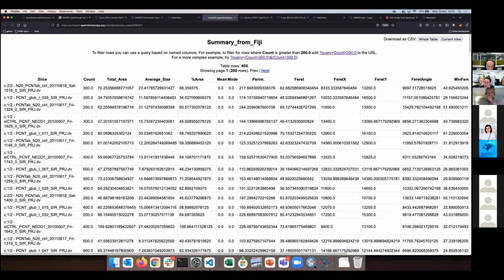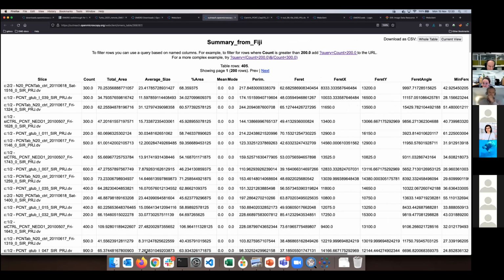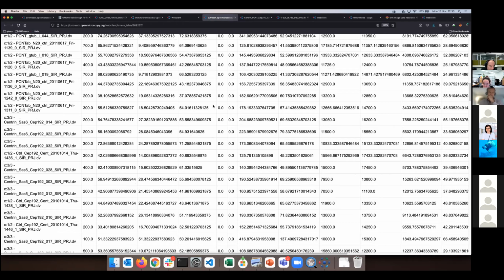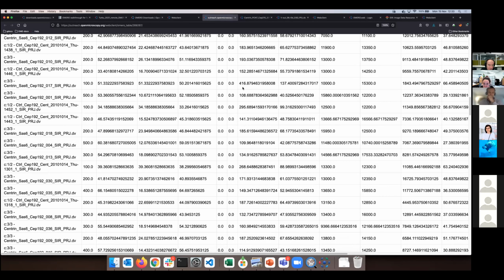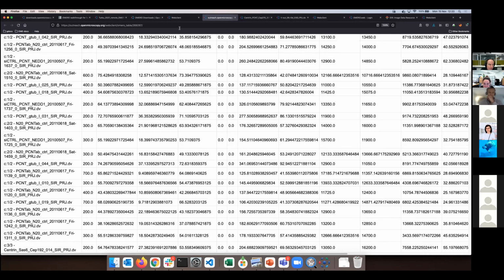That's how it looks. You can repeat that. We have that in the walkthrough, and we will go through that tomorrow. But now I want to draw your attention to that as a type of metadata which you can have in Omero. This is the so-called Omero Table, and it obviously has rows and columns, and I can query it here. I can view it in Omero Web.